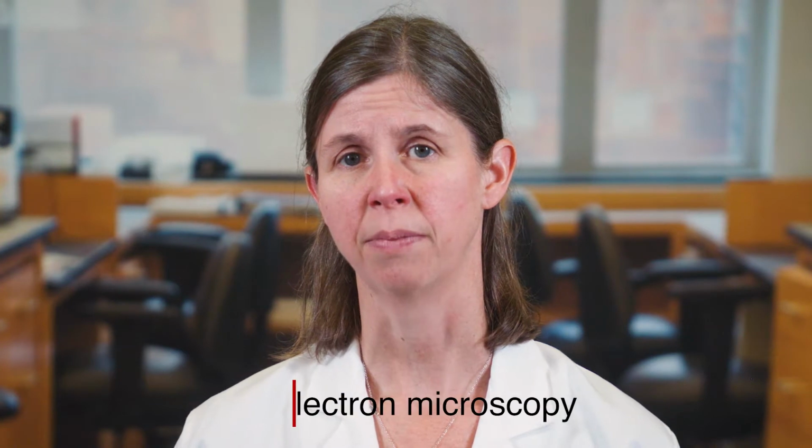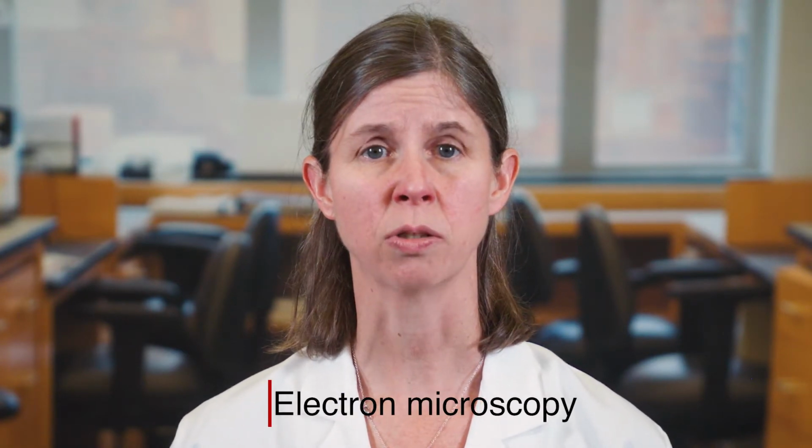The third type of microscopy is electron microscopy. It uses a stream of electrons rather than light to view the cells. The cells are usually stained with gold or a metal that is electron dense. Cells can be viewed at much higher magnification and resolution this way.